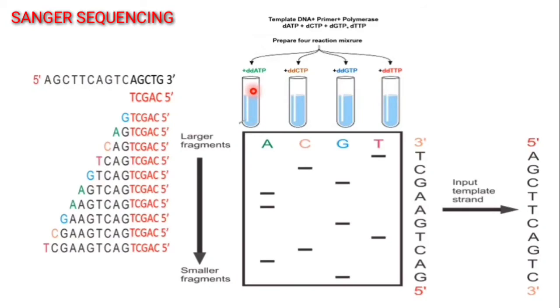The same template DNA will be amplified. Here the amplification will be terminated by ddATP, in this tube by ddCTP, here by ddGTP, and in this tube by ddTTP.